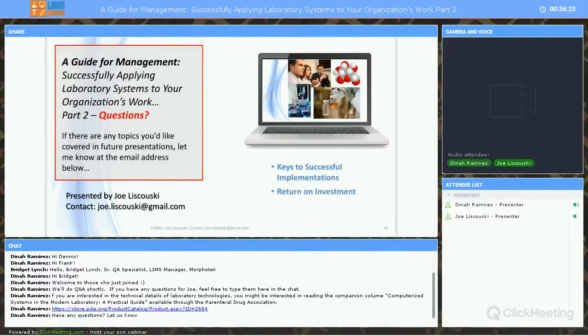The problem becomes really acute in research applications, particularly if you have multiple labs on different campuses where people may be working on similar problems. The need to bring all that stuff together into one spot avoids duplication of effort and not spending the same money twice.